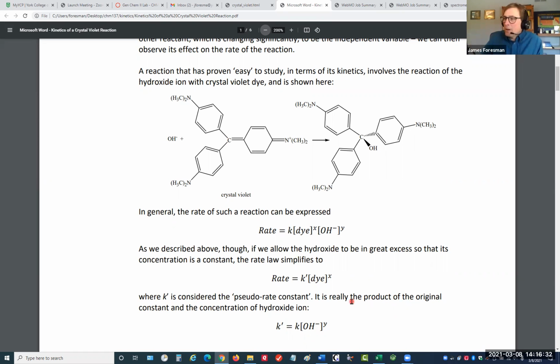The lab write-up continues. It shows you all the procedures that we would follow and the amounts that we would use. You need to read that, be familiar with it, maybe have it open as you do the simulation, because you're going to fill in things that are listed there in that procedure. But I'm going to move on now to the simulation itself.